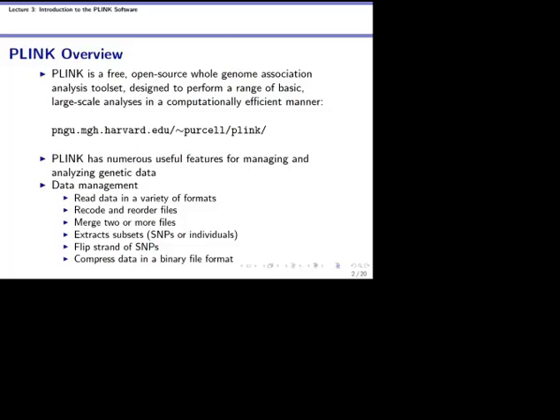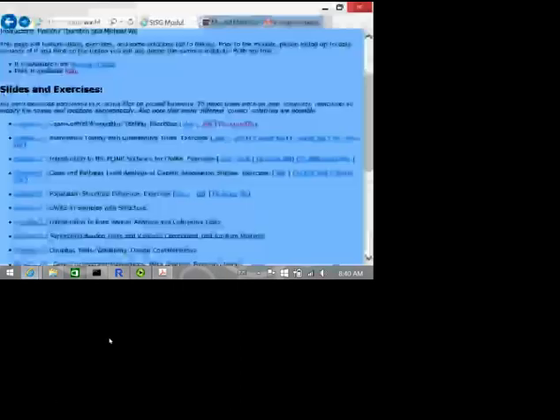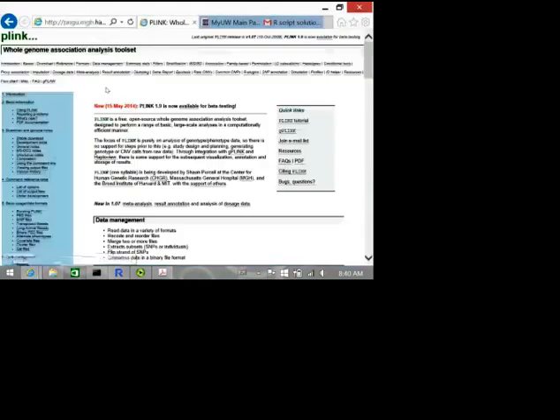All right. The website for PLINK is here, and there's a link to it on the course website. This is the main website that you'll be accessing if you have any questions about how to run things. It's an updated website. They do a really good job.